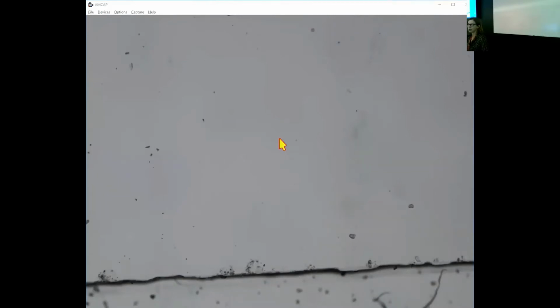It's got that infiltrative growth pattern. Yeah. But definitely it's a potential pitfall. And you'll even have what look like myoepithelial cells around the nests. We did start a study once looking at that, but too few cases really to make any impact. Yeah.